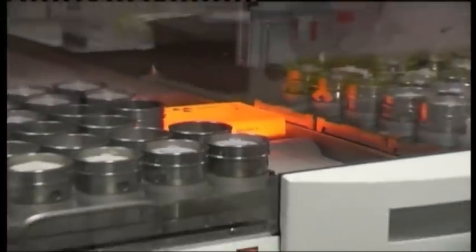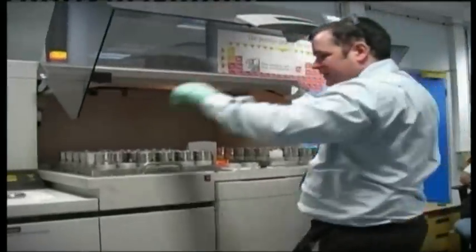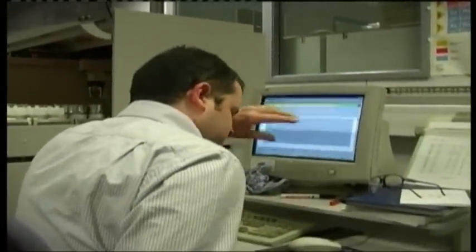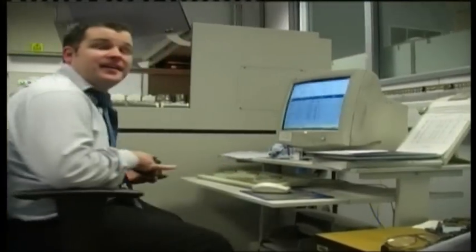If only one test is done or only one concentration used, there is a greater chance that mistakes can be made. The amount of the substance they are analyzing shows up in proportions relative to the binding agent or other ingredients in the sample. Each concentration will give a result showing the percentage of the purity of the sulfur and identify the other elements in the sample. If the percentages are about the same, we can trust the results to be accurate. I'm getting higher results of the sample. Yes. Nothing can be 150% of itself, can it? What was happening was difficult to grasp.